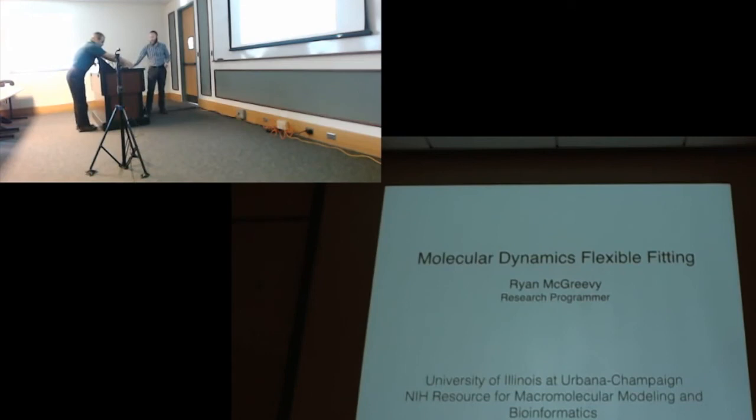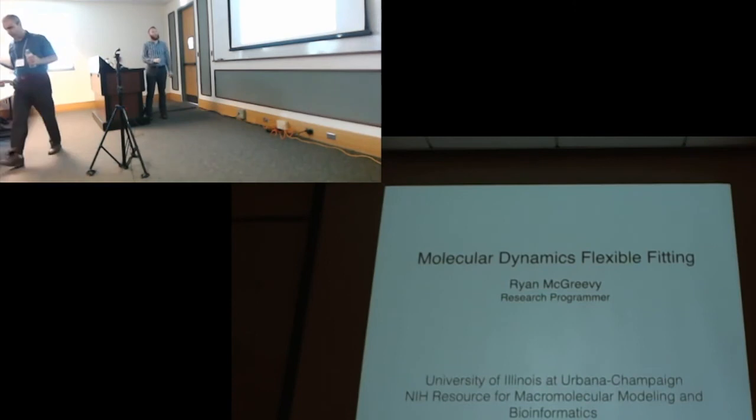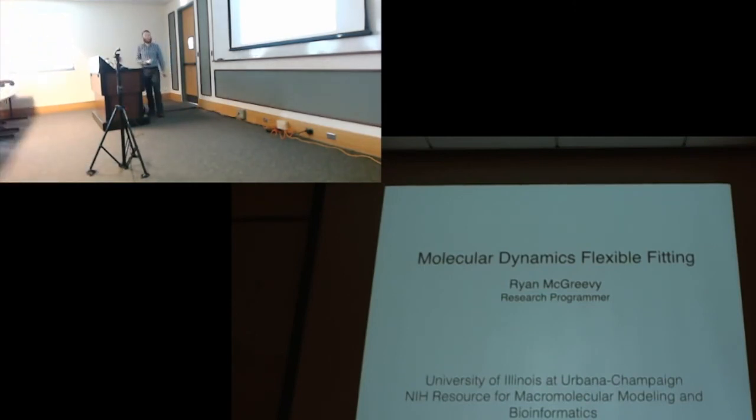Yeah, so as Ahmad mentioned, I'm a programmer here, and I work on molecular dynamics flexible fitting. And this is maybe a little bit different type of application of MD than you've already seen. Instead of using MD as a tool to investigate your system, it's more of a structural biology tool to build and model your system.